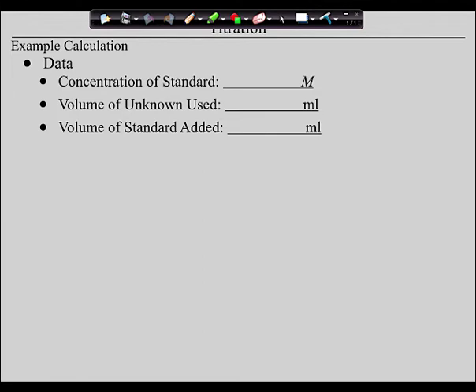So what we do is this. When we are titrating, and this is called a burette clamp, we put the burette in the burette clamp, and then guys, we fill the burette with our standard. So for our labs, the standard is always going to be the base. So we will put the base in the burette. Then guys, we need a place to put the acid. And what we'll do is this. We will use graduated cylinders to measure the acid, and we will put the acid in a beaker.